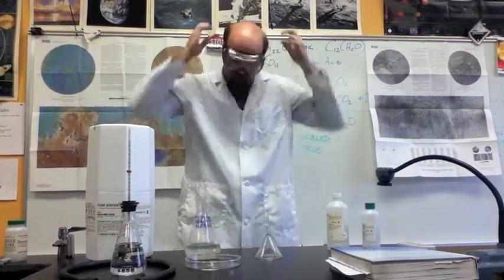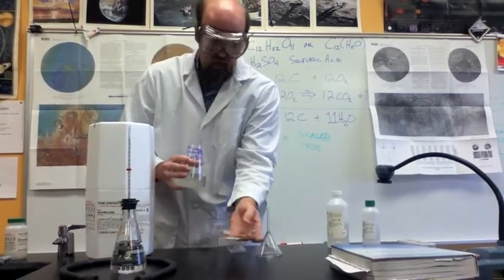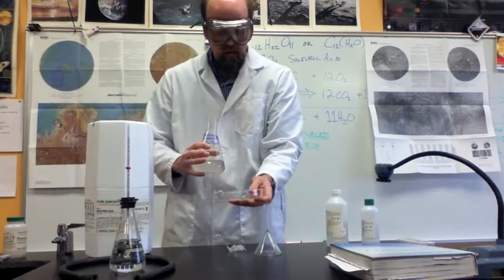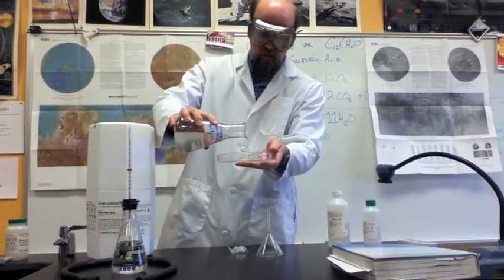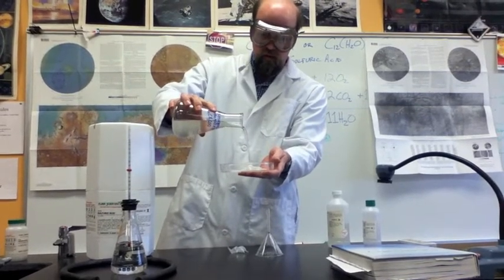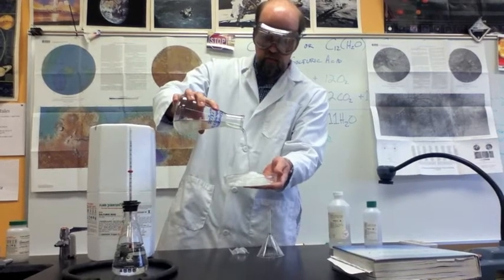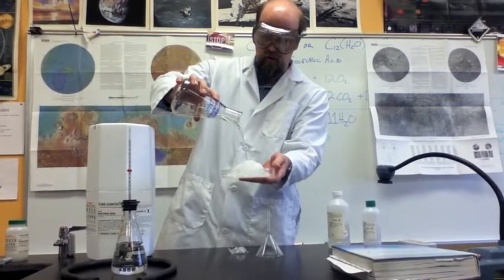It's a neat process to watch. I'm just going to pour this whole thing out — right here is a crystal of sodium acetate on this little glass plate. And sure enough, the whole thing is crystallizing right before our eyes.